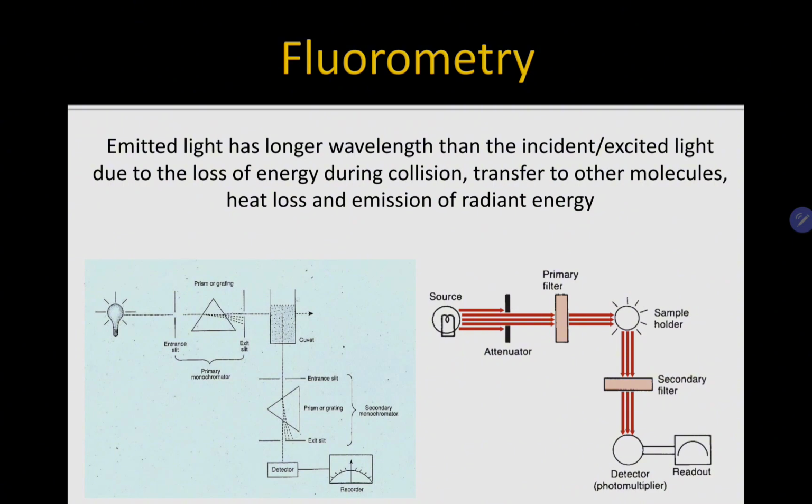So here in the diagram, guys, makikita ninyo na it uses the same principle of your spectrophotometry. However, there are certain filters na ginagamit dito para mas maganda yung kanyang pasok. So, you have your light source here, and then after ninyong light source, for the fluorometry, gagamitin dyan na light source, let's say for example, mercury na ilaw. Mercury emits ultraviolet light and visible light, okay? UV and visible light.